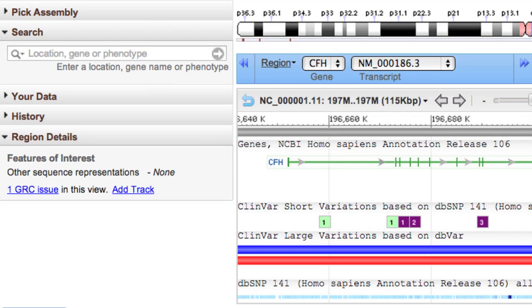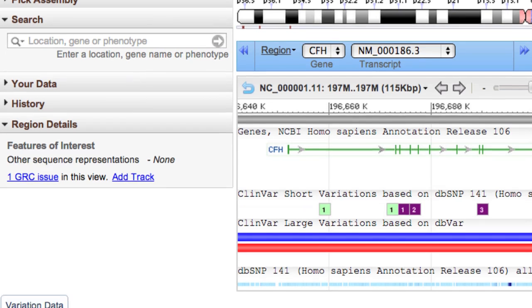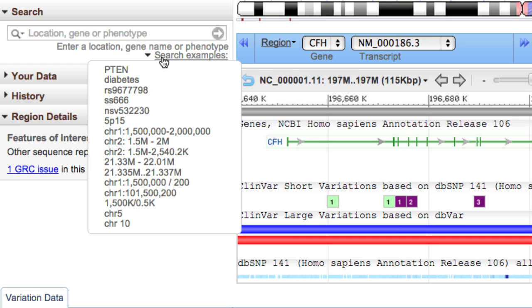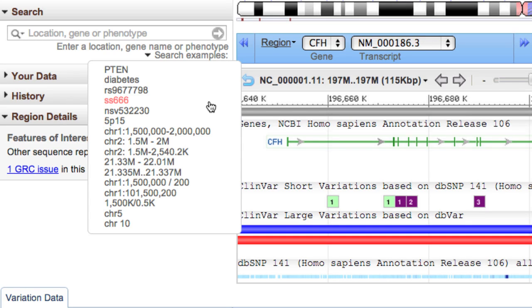To see what formats are accepted, mouse over the search component then click on Search Examples. You can input gene symbol, phenotypes annotated in our gene database, variant IDs from dbSNP and dbVar, cytogenetic band, and chromosomal coordinates.